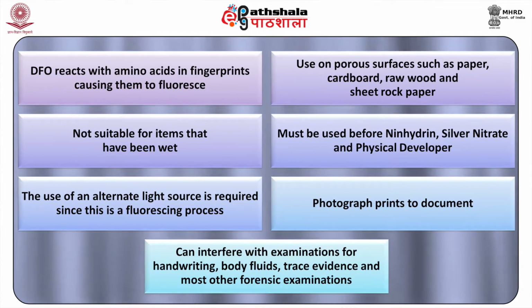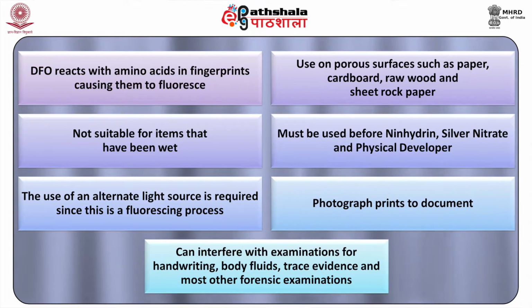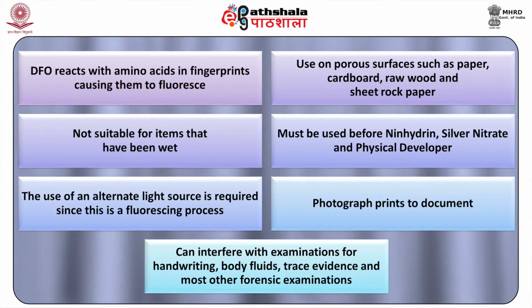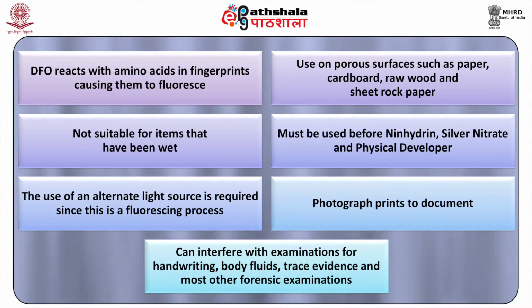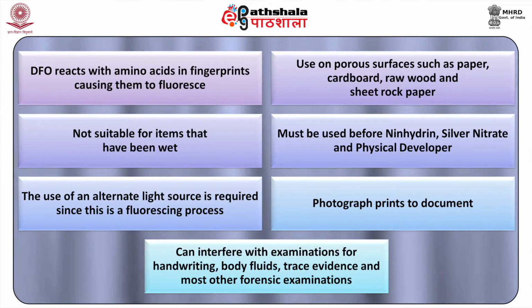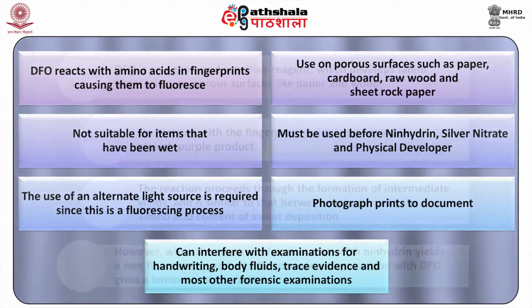DFO reacts with amino acids in fingerprints, causing them to fluoresce. Use on porous surfaces such as paper, cardboard, raw wood, and sheetrock paper. Not suitable for items that have been wet. Must be used before ninhydrin, silver nitrate, and physical developer. The use of an alternate light source is required since this is a fluorescing process. Photograph prints to document, as DFO can interfere with examinations of handwriting, body fluid trace evidence, and most other forensic examinations.